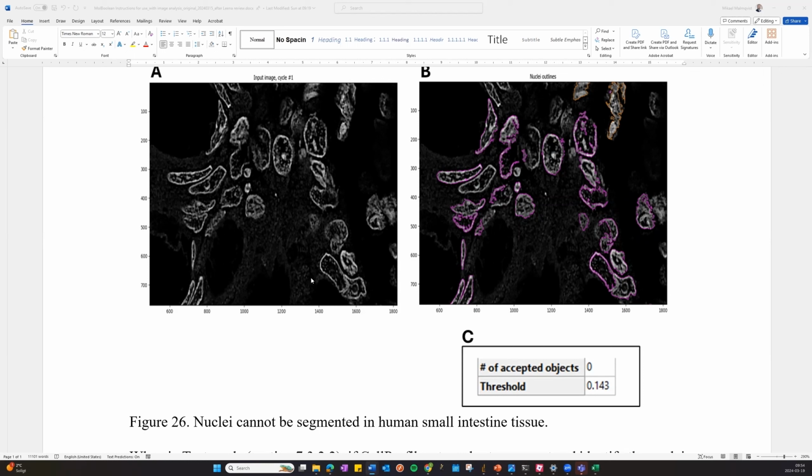There may also be cases in fixed cultivated cell lines where it is difficult to determine the number of nuclei. So the following instructions that I will show you now can be used in all cases where it is difficult to determine the number of nuclei in your image. I will now perform image analysis on such an example, and I will use MolBoolean tissue staining as an example image set. There are a few minor adjustments that can be made in the standard pipeline that would allow analysis in tissue. Basically, we don't need to perform the nuclei and cell segmentation in these cases.